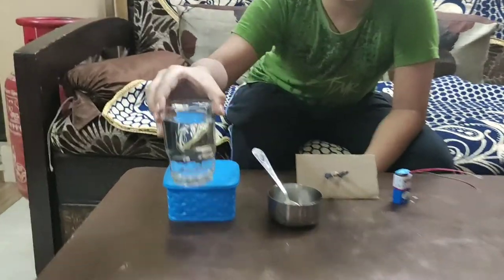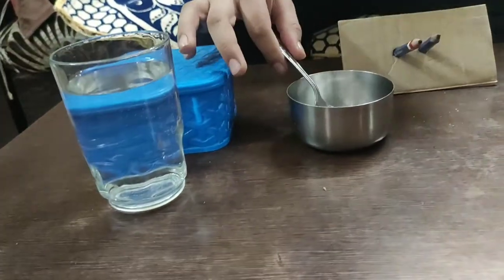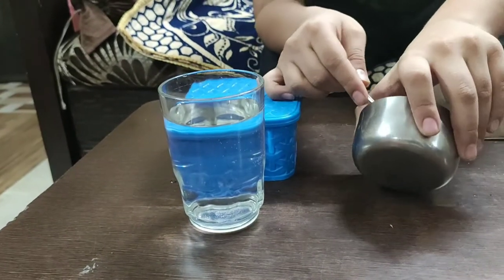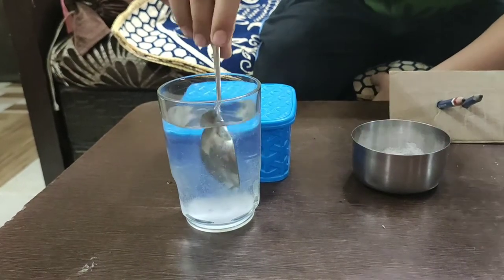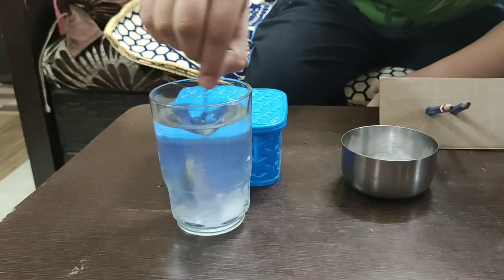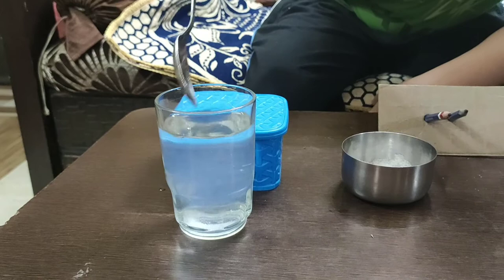We all know that water is a bad conductor of electricity. So let's make it a good conductor of electricity by adding salt. Now I have mixed all the salt into the water.